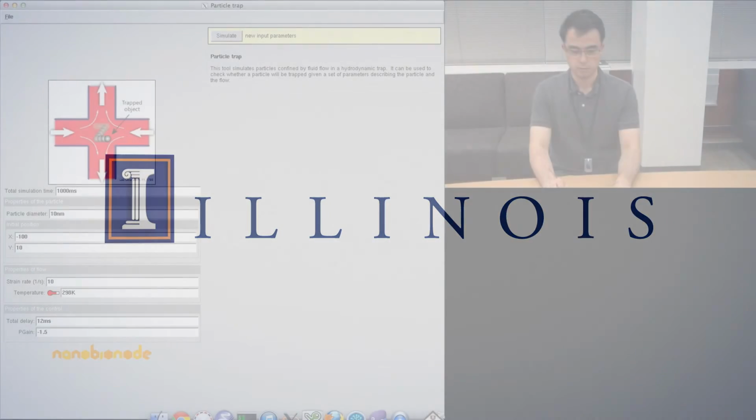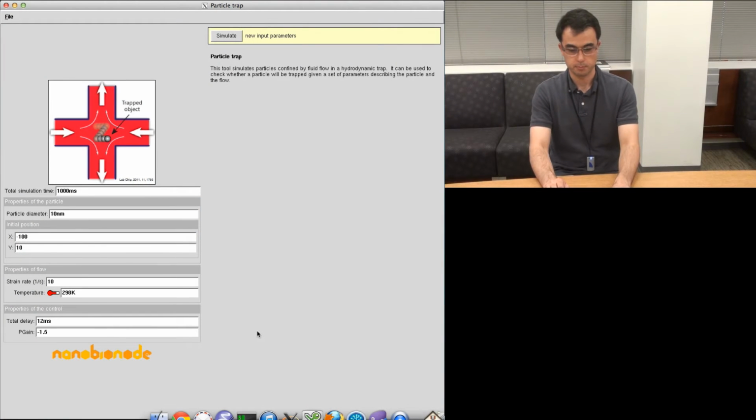Okay. Hello, my name is Melikhan Tanyeri. I'm a postdoctoral researcher at the Department of Chemical and Biomolecular Engineering at University of Illinois. Today I'm going to talk about the NanoHub tool that we have developed for hydrodynamic particle trapping.